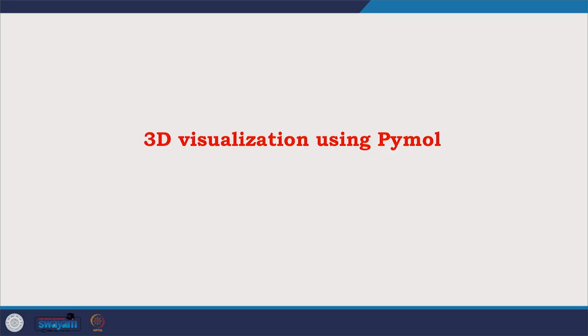I demonstrated the initial properties, what you could do from uploading the PDB molecule to analyzing it, and today I will continue from the part I have finished. So, let us continue with the demonstration of the 3D visualization using Pymol.